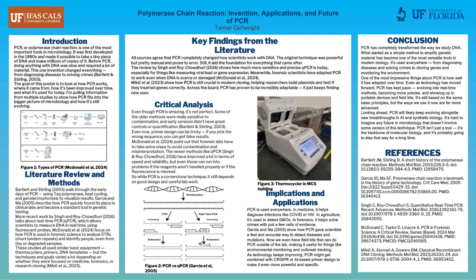The goal of this poster is to look at how PCR works, where it came from, how it's been improved over time, and what it's used for today. I'm pulling information from multiple studies and reviews to show how PCR fits into the bigger picture of microbiology and how it's still evolving.